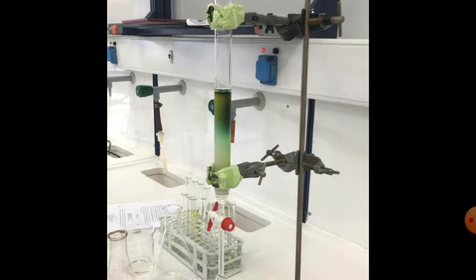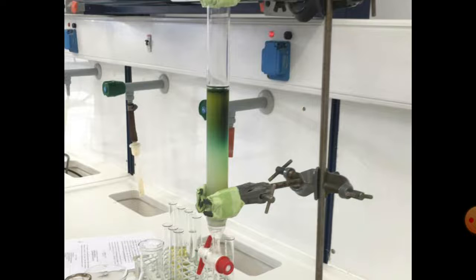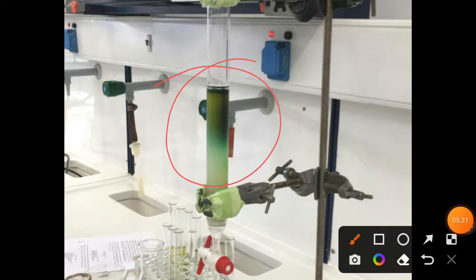With the help of this concept you can purify or determine the different types of components present in your sample. It is a very important and popular technique for purification in any research laboratory, and it allows us to use various kinds of mobile phases. Those are the advantages that I have mentioned, but it has some serious disadvantages too. For example, as you can see, the packaging of the column will not be a joke, right? It takes good technical skill and also takes a lot of time.